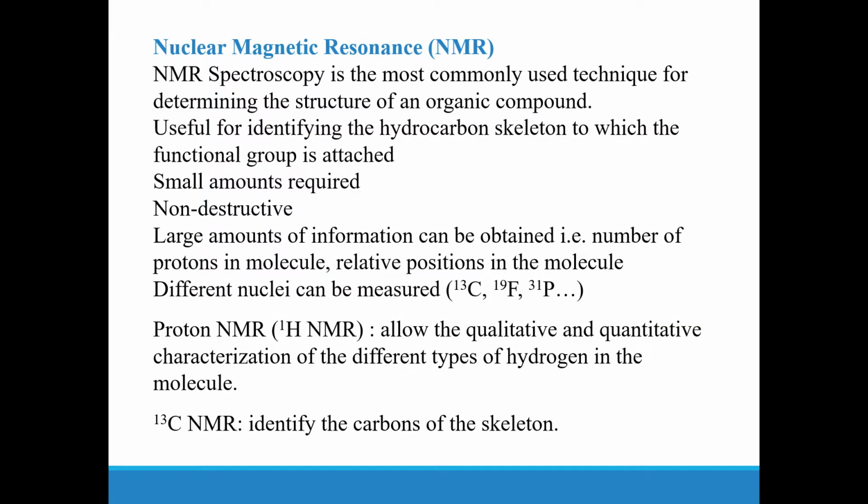In the previous labs, I've already touched upon NMR of the different compounds we've made during the whole semester. Now I really just want to go more in depth and give you an idea of what NMR is, how it works, and why we use it specifically.